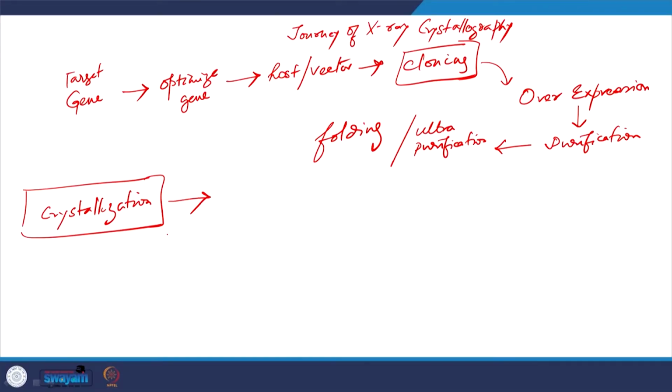We also looked at the science, what phase transition is happening, how the phase transition could be affected, and how our process could work on that. And we also discussed some modern methods by which you could improve, and among them one very important is using microfluidics in the Ismagilov Lab in Chicago.